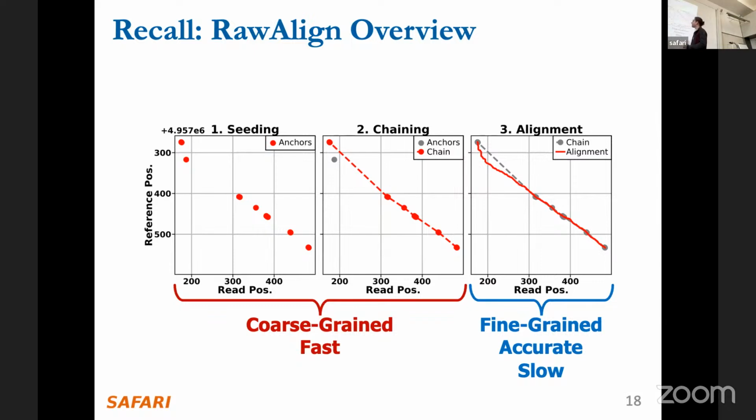Okay, very good. So there are some techniques in RawHash that subsample, but as a first starting point, you would take every position. So we take the raw signal sample at every location in the read, you query the hash table every time, and then it's the job of chaining to make sense of all that data. Here, I took an excerpt which is actually the correct mapping location. But if you look at the entire thing that you get out, this is really a huge plot, right? It's millions of lines in length, and it's more of a point cloud.